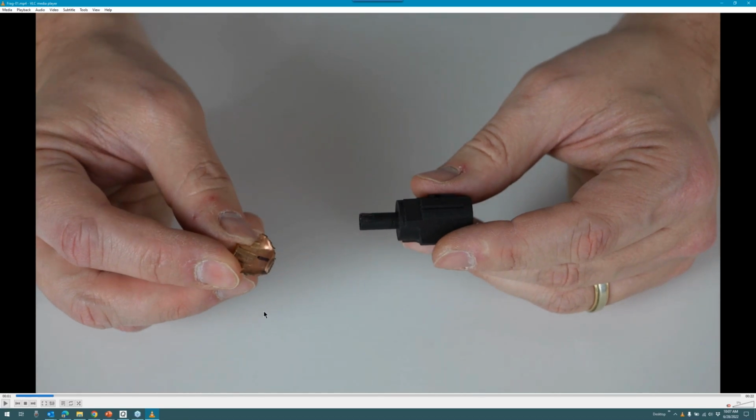So I'm just going to pause this for a second here. There is the dash I mentioned earlier. So that is that single indentation on the side of the stub. The fragment's in my hand, and ultimately I'm going to be using some wax to place that on the side of the nose of the stub here, and then the fragment is going to get placed into that wax.